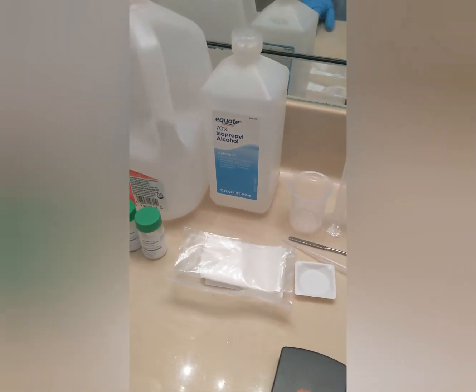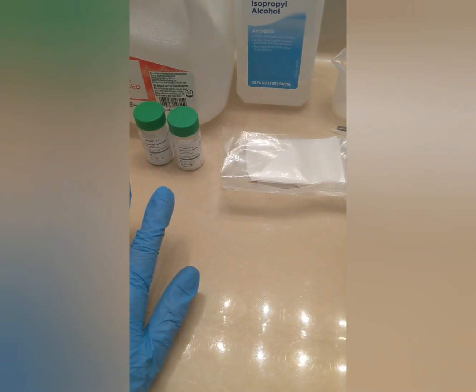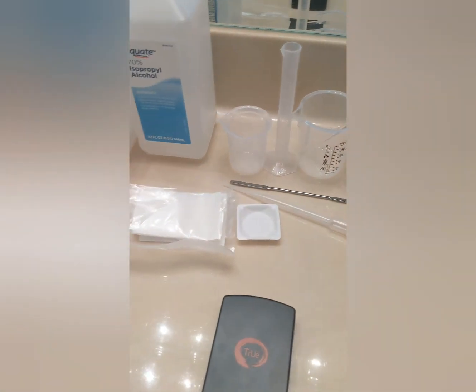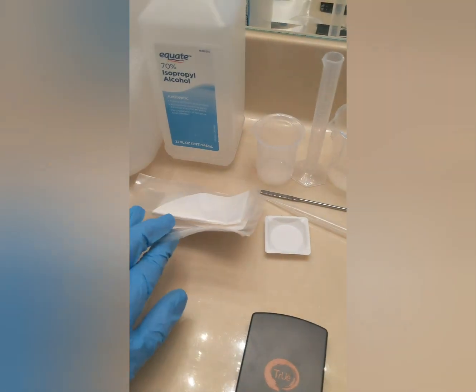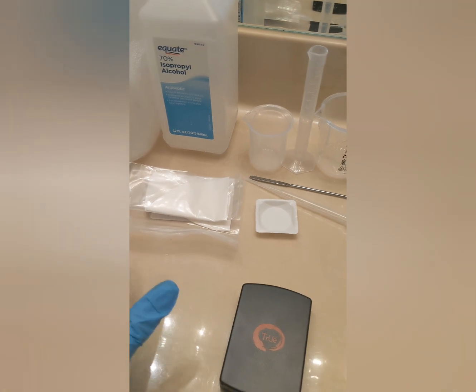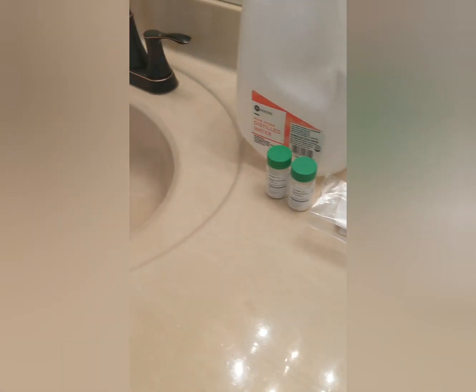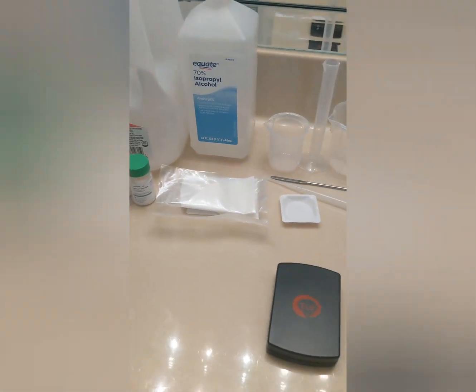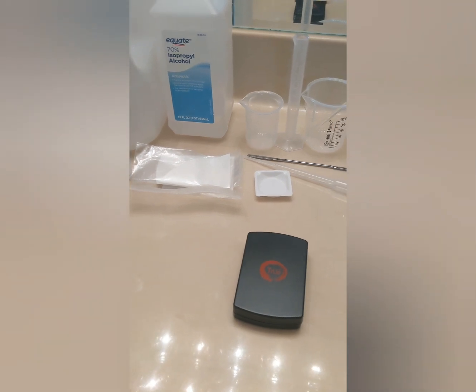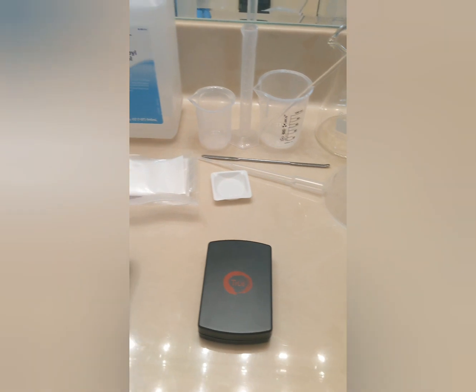The procedure for the lab will involve two separate mixtures of the sodium carbonate and calcium chloride with distilled water, and then afterwards mixing the two to allow a reaction. We will then use gravity filtration to separate the precipitate from the supernatant. The supernatant can be flushed down the sewage system, and then the sewage drainage system will be flushed for about 10 seconds. The precipitate will then be allowed to dry overnight.